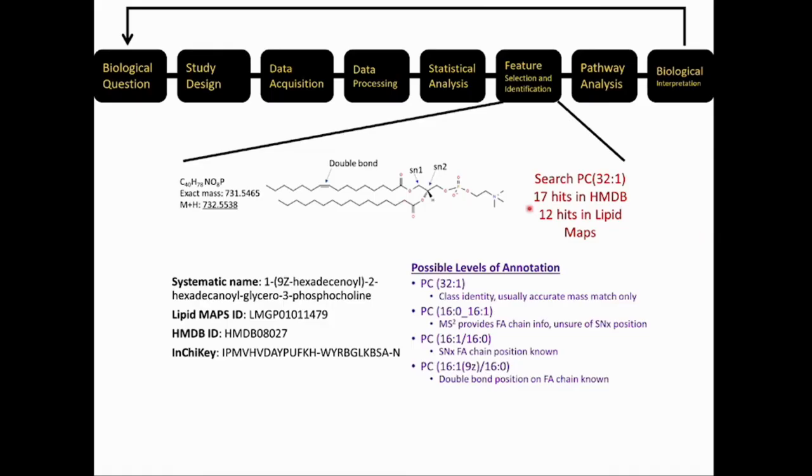So just to give you an example, depending on the type of sample preparation that you do, in the case of the TBI study, what we did is an extraction of this serum sample with a non-polar solvent. And in this case, most of the peaks that you're going to get are lipids. And lipids are particularly challenging to annotate because they have different chain lengths. If you remember this from your biochem class, they have different chain lengths, different head groups, different double bonds, and different positions.